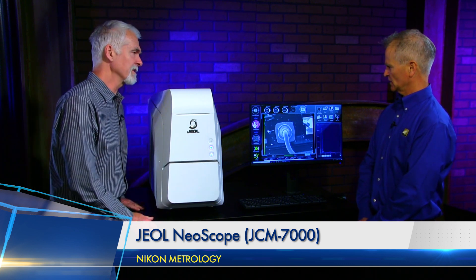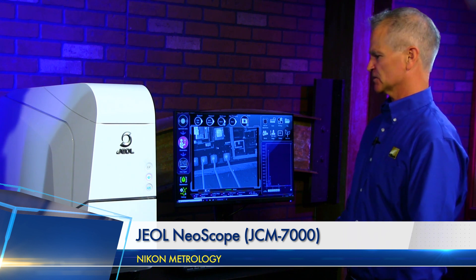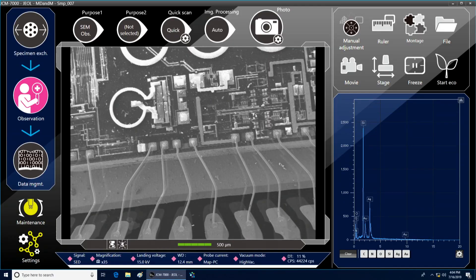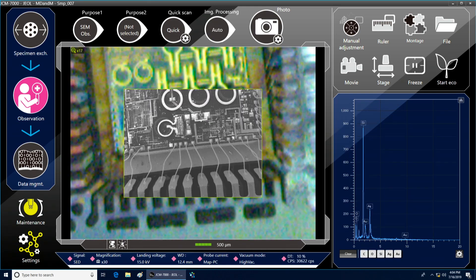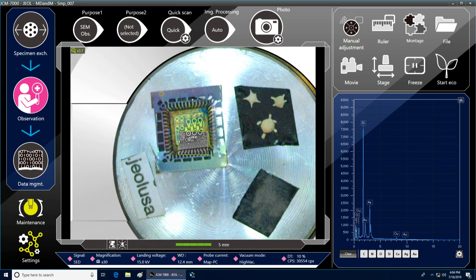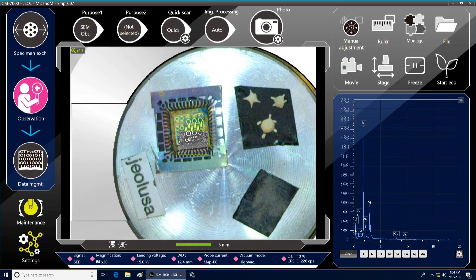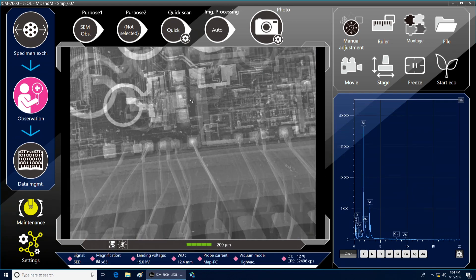One thing we didn't go over was the stage navigation system. When I put my sample into the fixture and close the door, there's an optical camera in there that captures the part as it passes under — kind of like your license plate in a toll booth — in the sample holder. As I scroll down in magnification, that part in there is displayed with a live view. That's called our zero mag. As I scroll in on my sample, it seamlessly transforms from the live optical image to the SEM image.